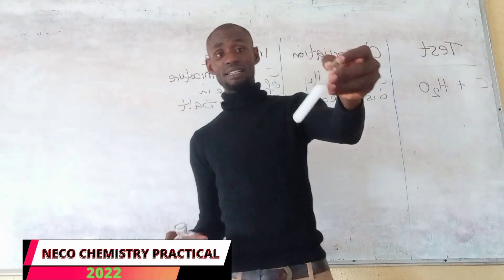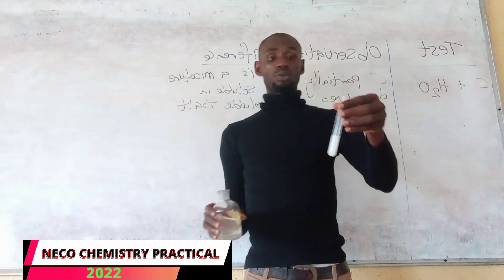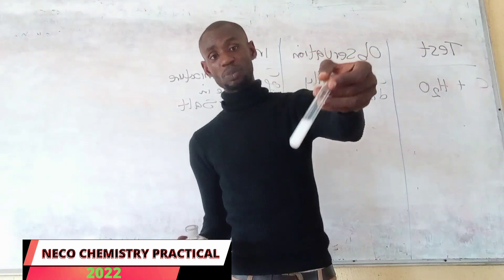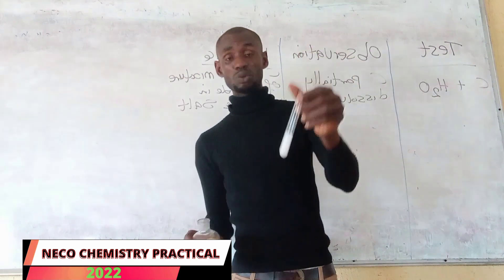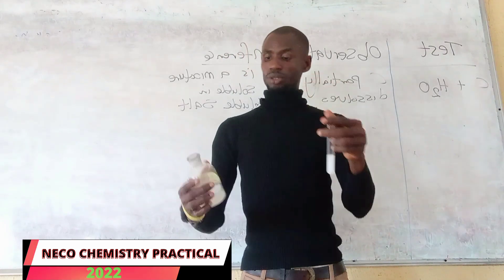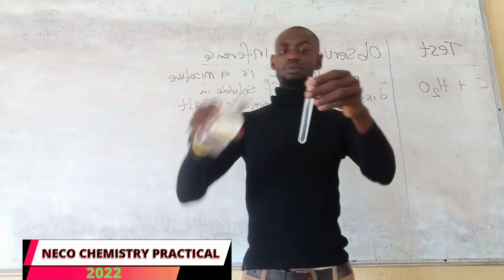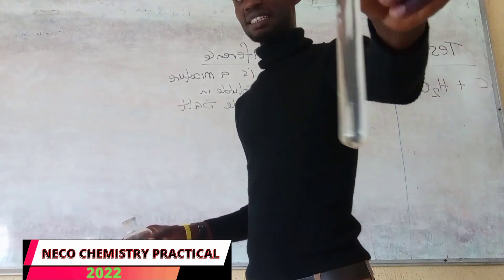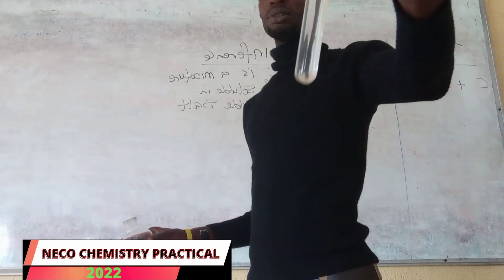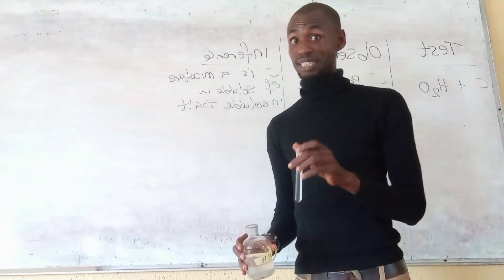You will see that the precipitate still remains on adding HNO3 — there are no visible reactions. I then add aqueous ammonia, and you will see that the precipitate dissolves completely to give a colorless solution. This confirms that we are testing for the chloride ion.